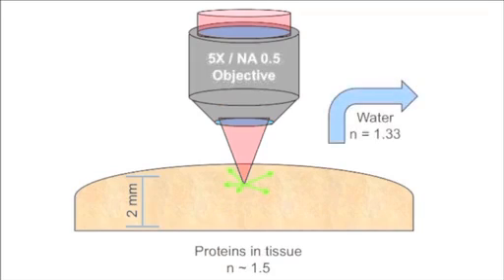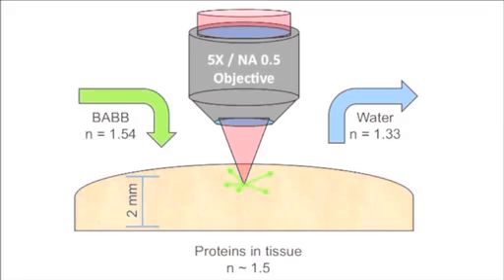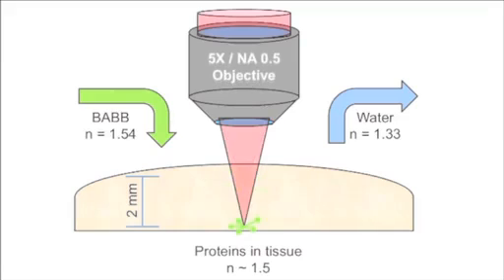To overcome this limitation, the organ is dehydrated and the water is replaced with a fluid that has a similar refractive index as the proteins that make up the tissue. This process of optical clearing helps to greatly reduce light scattering to allow for better imaging farther beneath the tissue surface. Images from Parra et al.